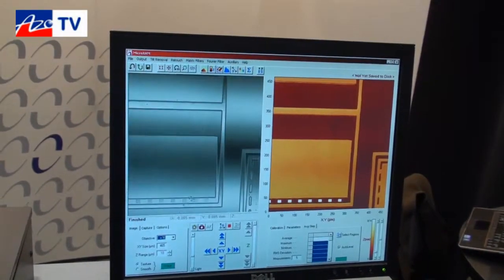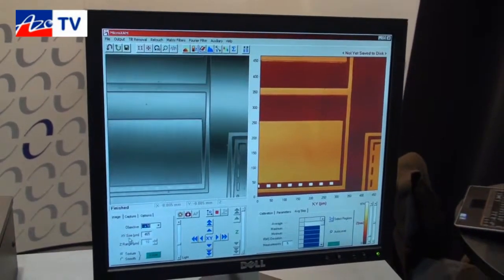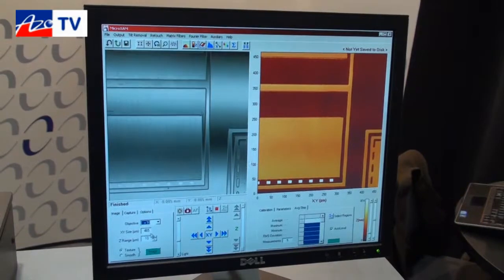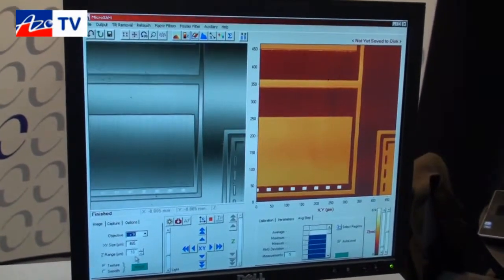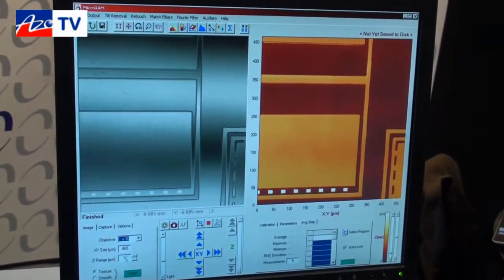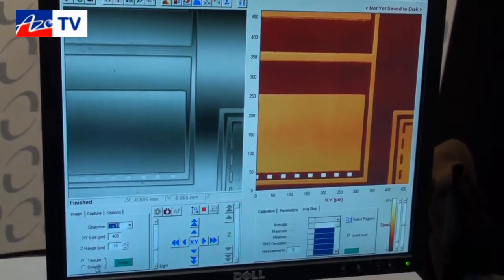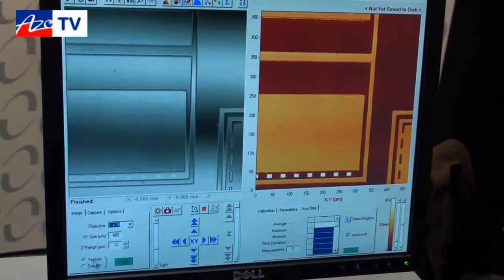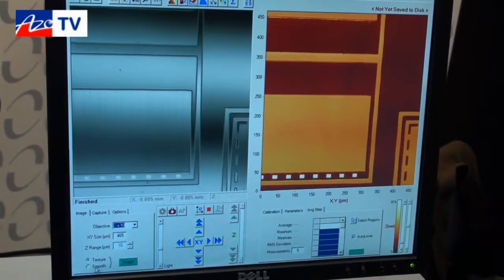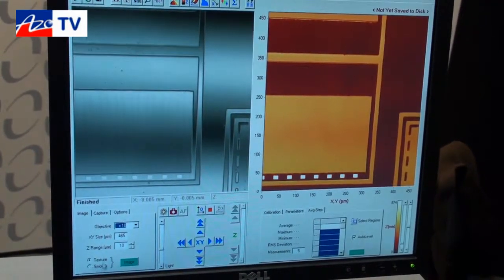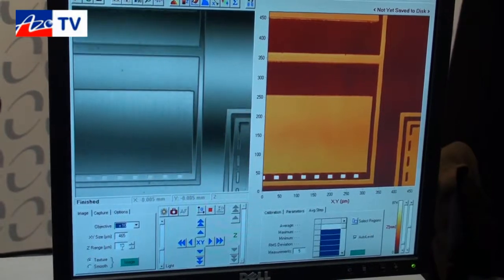We select what objective we are going to use, which tells us our XY dimensions. For our Z range, we can go from smoother texture using phase shift or scanning white light, going to a very high resolution scan up to 250 microns.